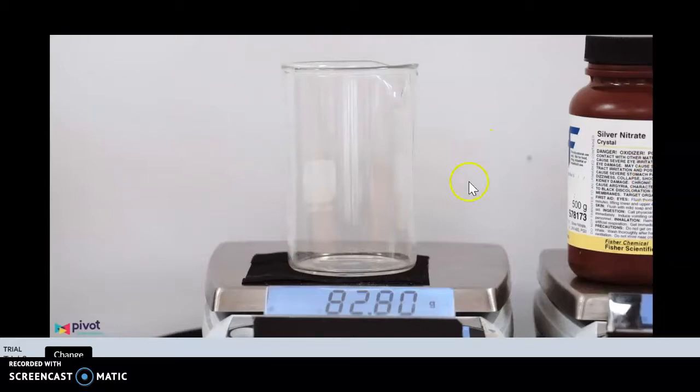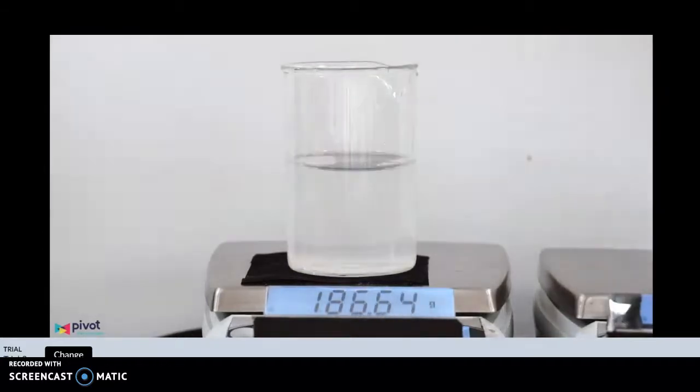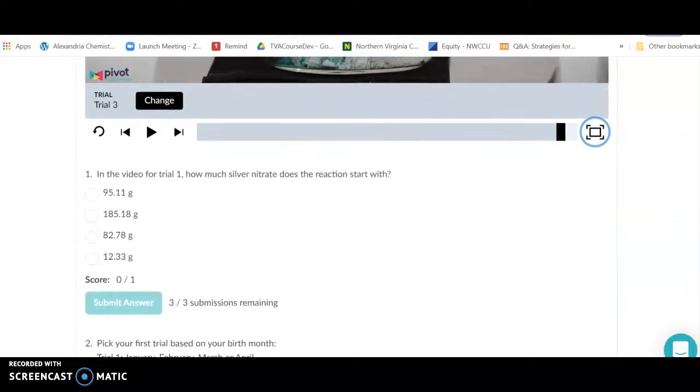We have a bottle of silver nitrate, but we won't weigh that at the end. We have a beaker — write down its mass. Then add some silver nitrate and write that value down. You'll need to record masses every time something is added. We take 92.92 grams, which is our beaker plus silver nitrate, then add some water and record that mass — that's the total weight of the system. Then you'll put in a piece of copper. They won't let it react completely, so at some point we'll have to figure out which reagent was used up.